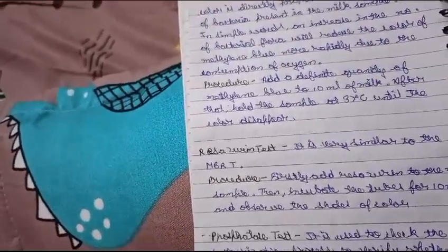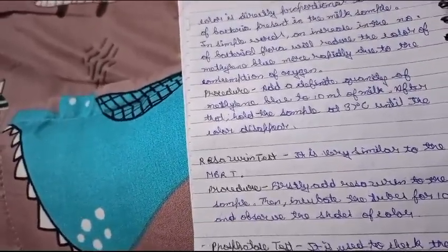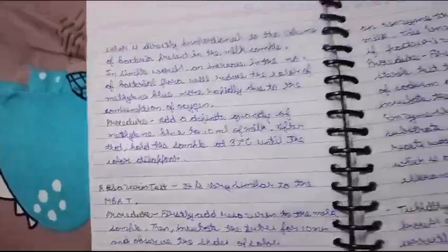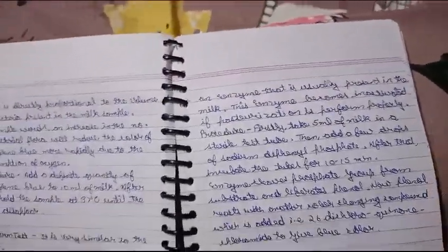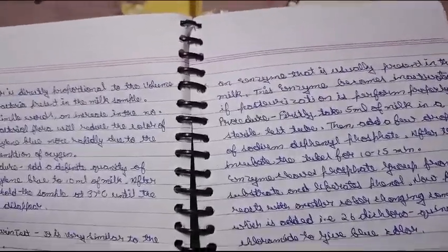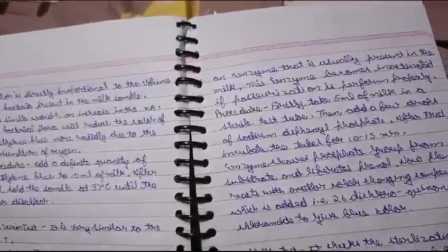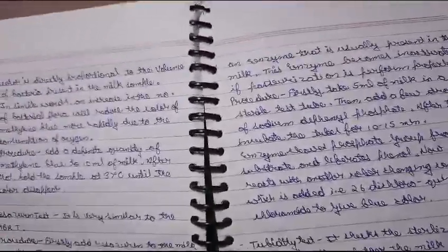Next test is phosphatase test. It is used to check the pasteurization process, to verify whether milk is pasteurized or not. Phosphatase is an enzyme that is usually present in the milk. This enzyme becomes inactivated if pasteurization is performed properly.